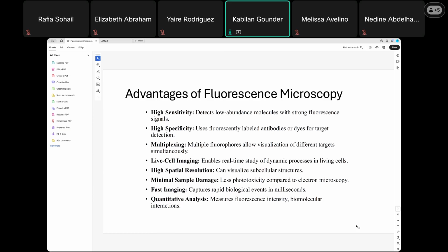Also, you can do in situ hybridization, that's the FISH technique, which also gives you more data on genetic abnormalities and other aspects. So with this kind of study, fluorescence microscopy, when compared to bright field microscopy, gives you more information on cellular events.